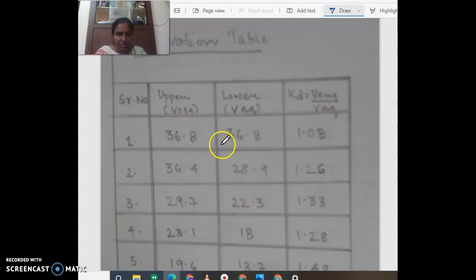Like that, we do the first titration. I'm repeating the procedure. First, you take a reagent bottle. In that reagent bottle, 50 ml of N-butanol and 50 ml of 5% acetic acid, that means acetic acid dissolved in water. So in the reagent bottle, three chemicals are there: acetic acid, water, and butanol.